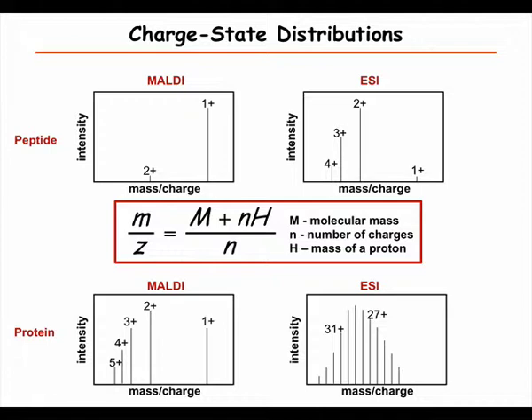Yeah, so in MALDI, what you do is you crystallize a small molecule, usually things like nicotinic acid, sinapinic acid, and they form a crystal. But you have a mixture of your proteins and peptides. So the peptides and proteins get embedded into this crystal, and then you shine a laser on it, and the laser deposits lots of energy.